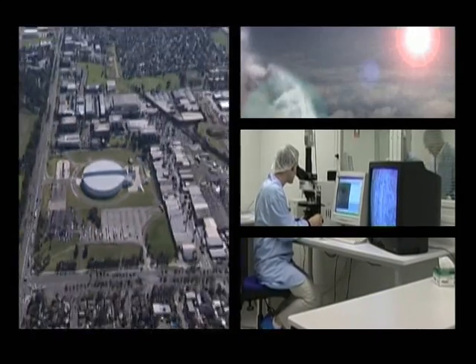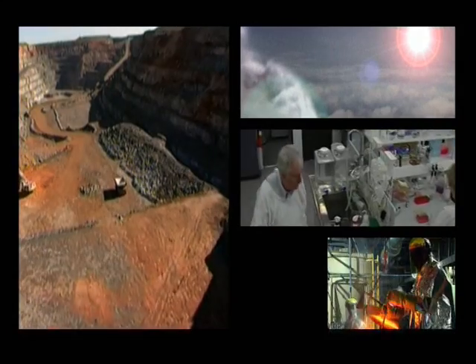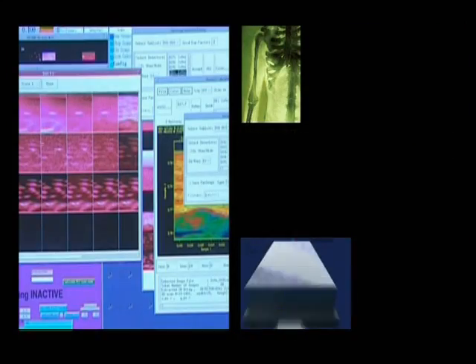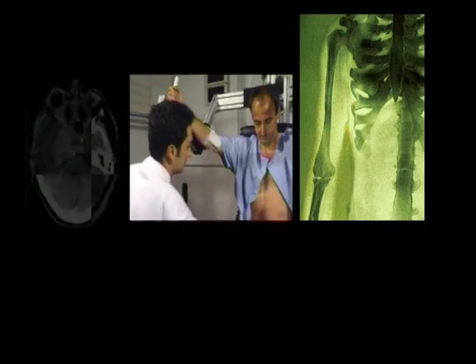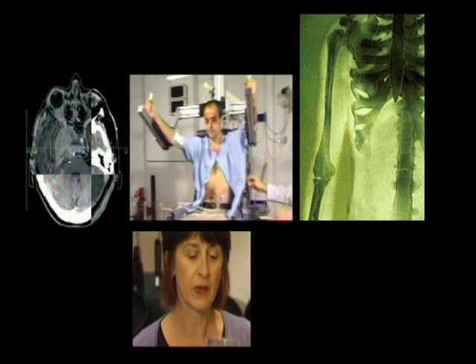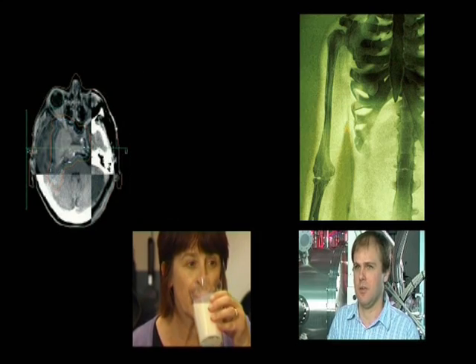The Beam Line is used by researchers from many different industries, including mining, pharmaceuticals, agriculture, forensics and more. Scientists study samples and systems such as muscle and membrane structures, chemical reactions and catalysts, advanced materials and food components. So basically, if it's something that's of interest from the scale of atoms to molecules, chances are you may need to use this Beam Line for what you're studying.